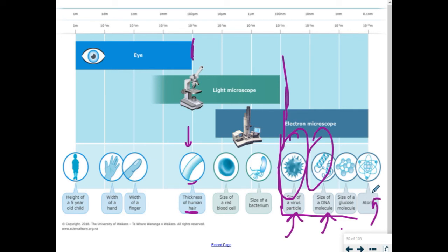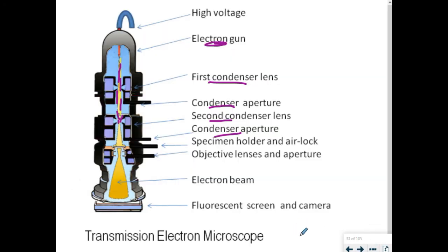It's actually very challenging to see atoms themselves, though, because how does the electron microscope work? It shoots electrons. Well, if atoms are made of electrons, you actually can't even get a picture of an electron with an electron gun, because that really just doesn't work. Sorry, my microphone's falling off here. Let's say that you wanted to shoot electrons at atoms themselves. That's basically our limit right now. If you shoot an electron at an atom, you can't actually see another electron by shooting an electron at it, because as soon as the electron hits the other one, it moves it. So there's some practicality problems there.